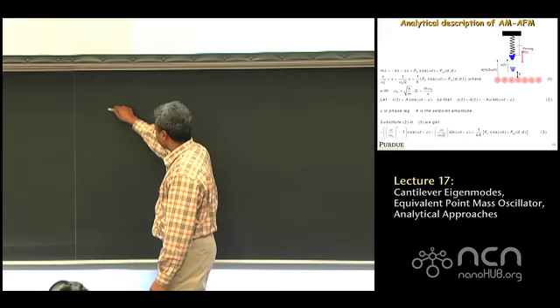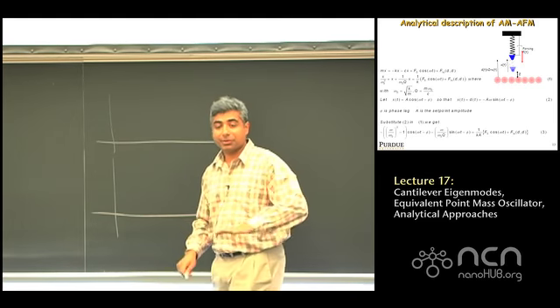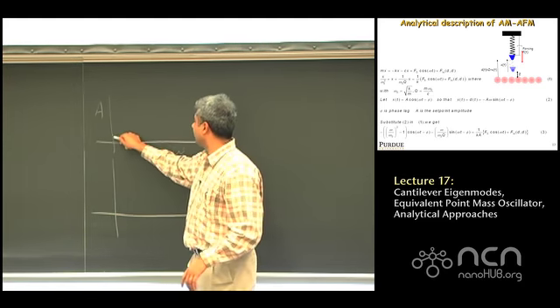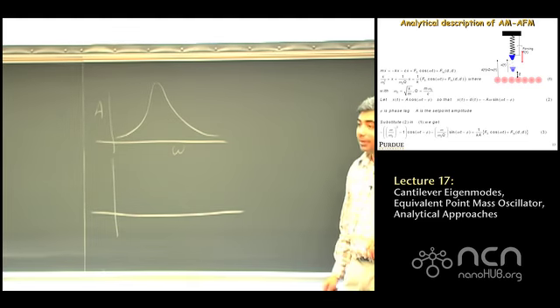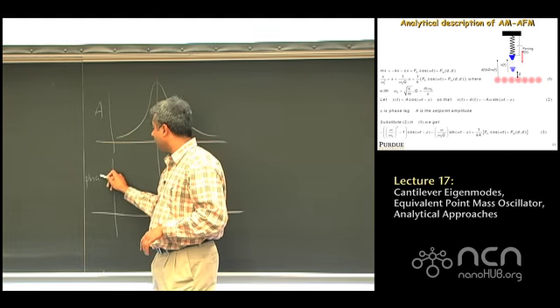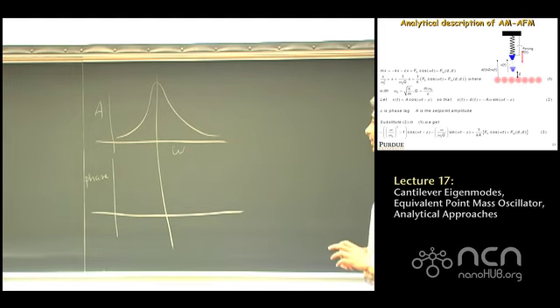So the easiest thing, in my opinion, to do is simply to do a tuning curve. You withdraw from the surface, do a tuning curve about that resonance, and you plot A versus frequency, right? And you get this resonance curve, which you want to operate on. While you do it, make sure you plot the phase, or whatever they call the phase. And nobody tells you that it's a phase lead or phase lag. They're just going to say phase, right? That's all they're going to say.